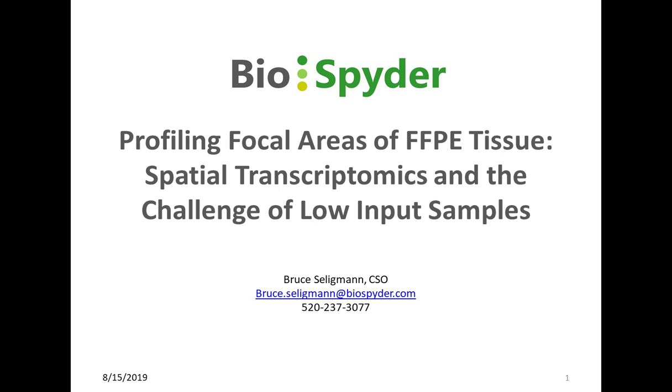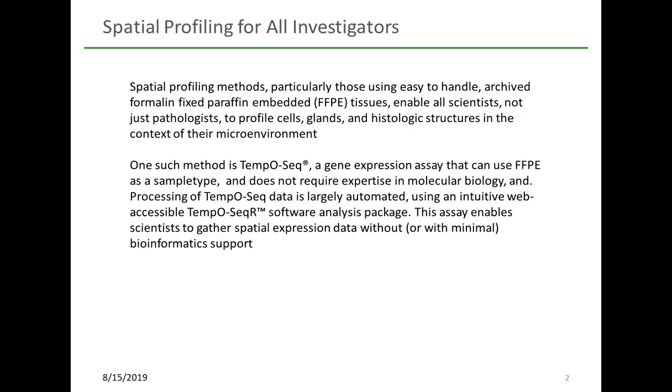Now, that is a new technology, a new methodology with several platforms, either just recently commercially available or in development. But I think spatial transcriptomics means different things to different people. And so I'm going to try to address some of those differences as well as some of the considerations in selecting a platform to pursue.